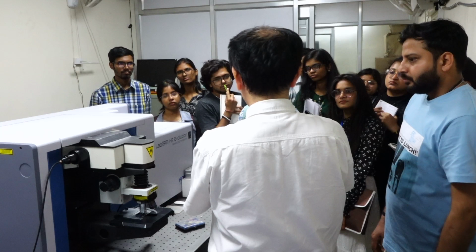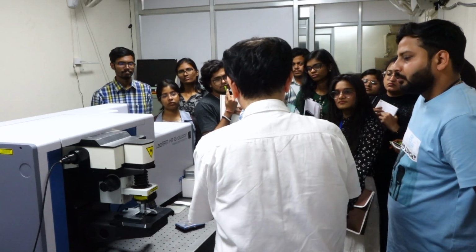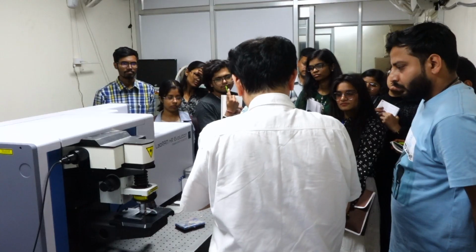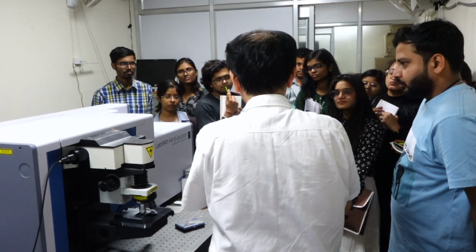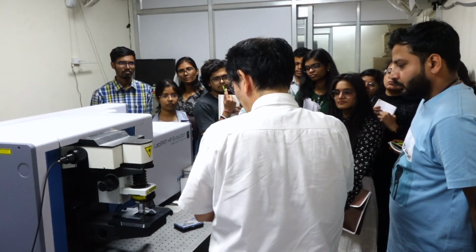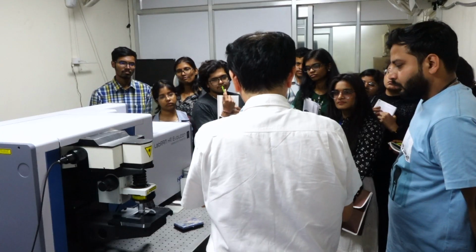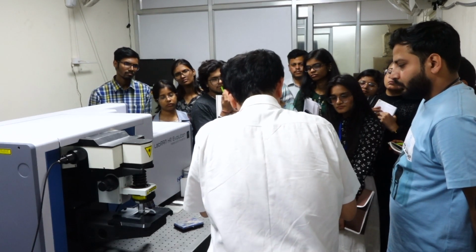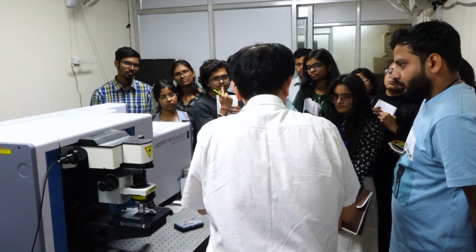determines the area that one can see at once. So the size of the focal spot is different. By using higher magnification, the spot becomes smaller. That is, we can irradiate a very, very limited spot.